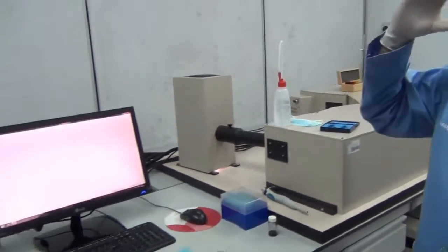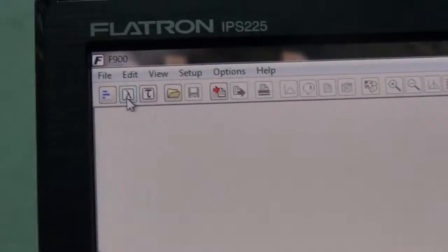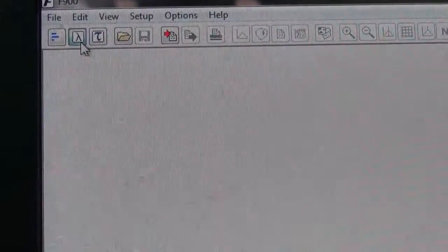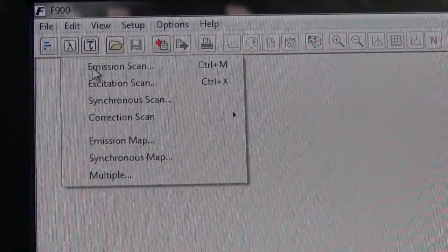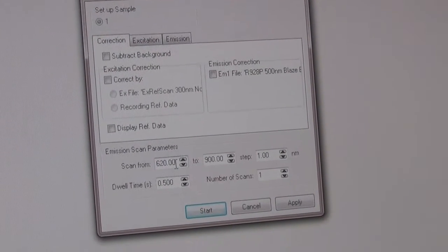Back to the instruments, and click this lambda icon. This is the lambda icon. Click it and click emission scan. So a new interface will be shown. So what you need to do is to set the scanning range.